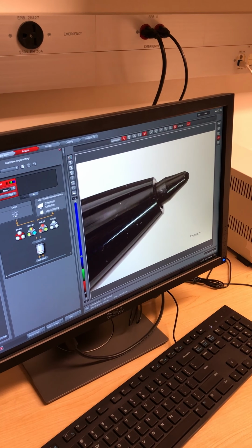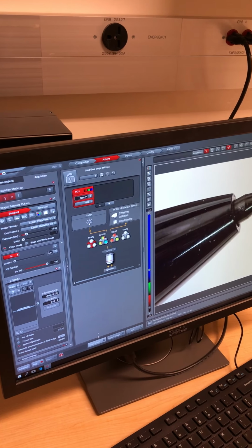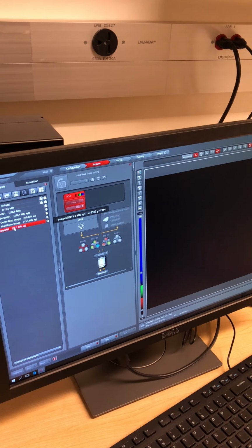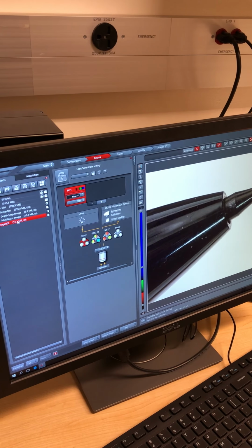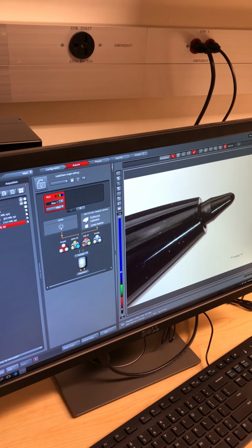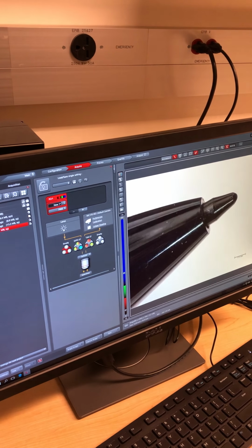Second save. I know I'm barraging you with questions here. Sure. Second saving question. So this is being spit out as a proprietary Leica format, or how does this go? It's being spit out as a LIF, L-I-F. So that's a Leica image file. And you can see the scale bars there. So if you've got it on the screen, it's going to show up in all of them.